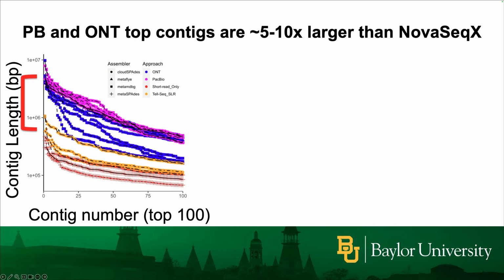And so from here, it's pretty clear that short reads is really a thing of the past, and with long reads, you get way longer assemblies. And it was also clear that the PacBio approach generally across all the contigs assembles into longer contigs, and that this was really specific to the assembly method which was used.